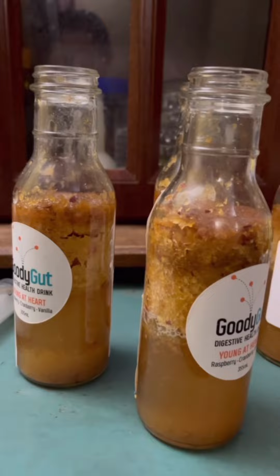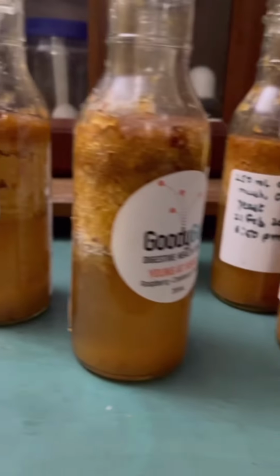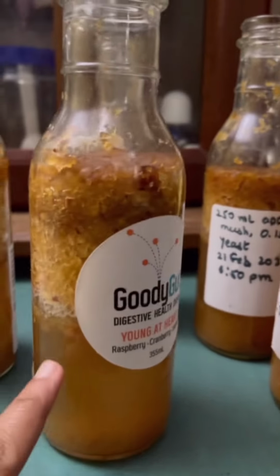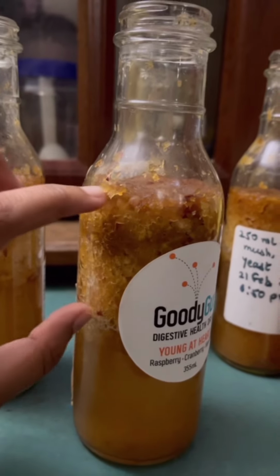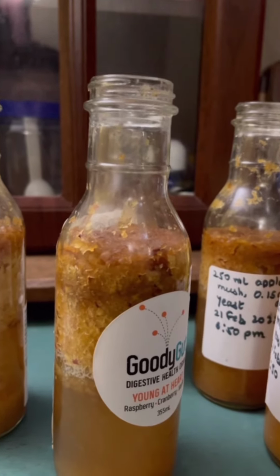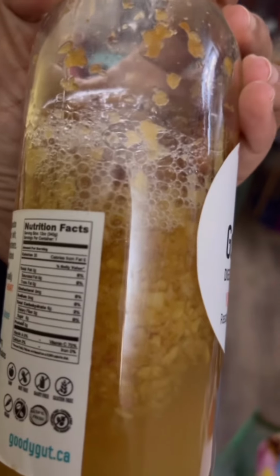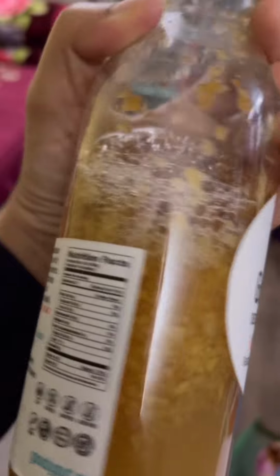With regards to sensory results, the color of the pulp has changed significantly. There is liquid on the bottom, and the fruit pulp, the residue, came on the top. The fragrance of this is quite fruity and strong. There is still bubble formation, so the fermentation process is still ongoing.